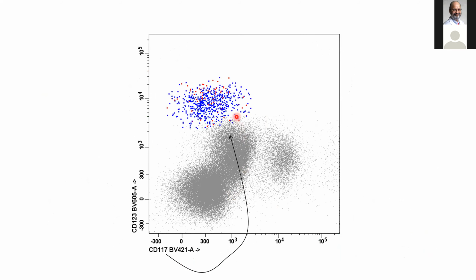Okay, as far as CD117 goes, our threshold is over here, okay? So both our basophils and plasmacytoid dendritic cells, for the most part, should be negative for CD117. The reason I pulled this plot in here is specifically for the basophils. In a lot of our chronic myeloid leukemias, where we have basophils that are part of the neoplasm, you can see them pick up CD117. You're probably getting an expansion of immature basophils in those scenarios.